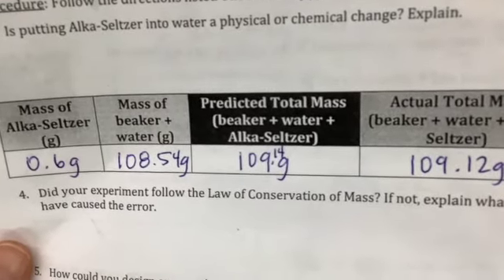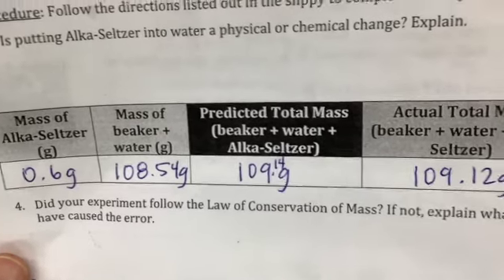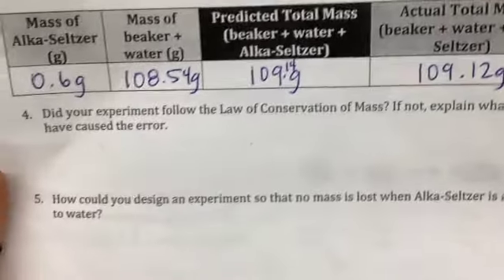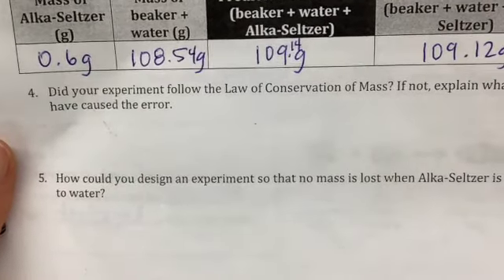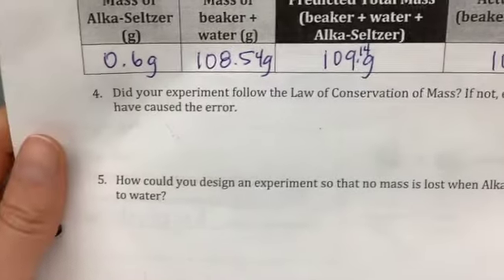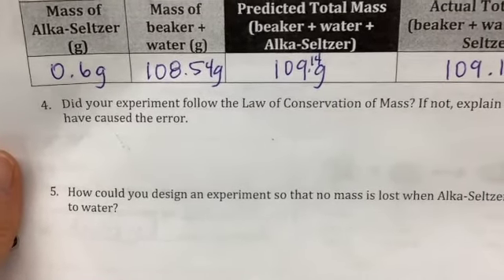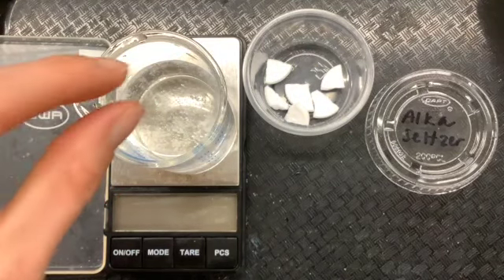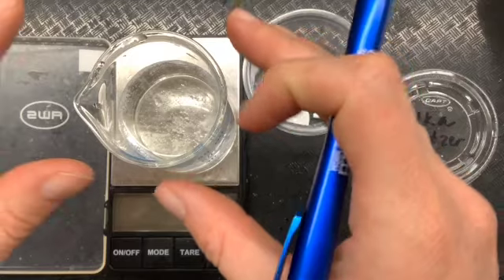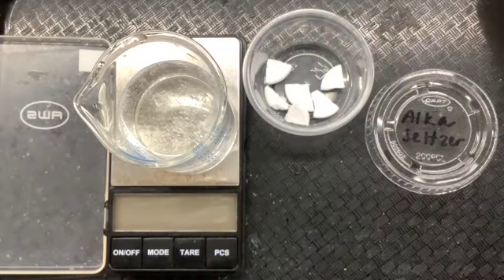So did the experiment follow the law of conservation of mass? If not, explain what could have caused the error. And then my last question is, how could you design an experiment so that no mass is lost when the Alka-Seltzer is added to water? So what could you do to this experiment to change it so that the gas bubbles didn't escape into the air, and were still right here in our beaker? So what could you do? Write that in for experiment number 2, and we're all done with station 3.